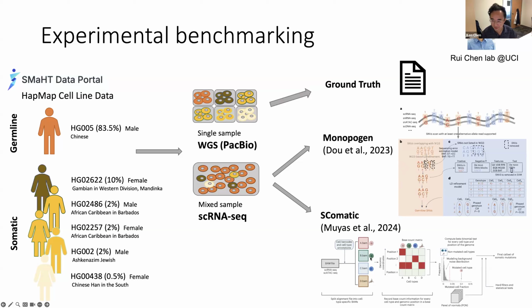Those can be done by cell type, by transcriptomics, or by any other approach. So they require you to tell the program in advance which cells belong to which cell type or cell clusters. And based on those separated cell clusters or cell groups, you can perform a sort of contrastive mutational detection using an algorithm like MuTect to identify clone or cluster-specific variants, using other cell clusters as a reference, as a background. So as you can see, it's a very different type of analysis. Ours is delineated at the allele and single-cell level, and theirs is performed at the cell type or cell cluster level. I'll show you this actually makes a huge difference.